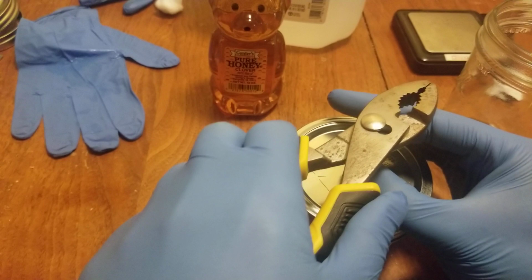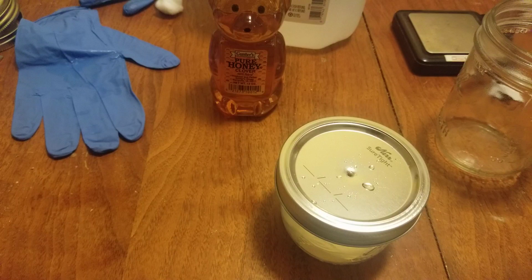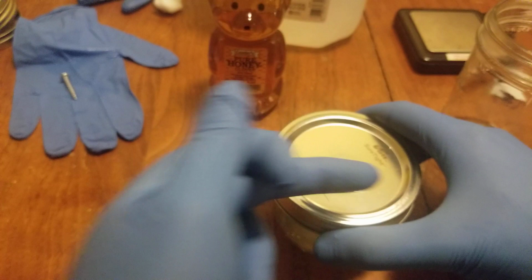All right, I doubt you guys actually heard that, but I did. Try to make that hole a little bigger. All right, that looks good, we can probably get a needle in there. So now that we got our hole in there, let's try to get some of that water off from there, with my hand, of course. Perfect. That looks good to me.